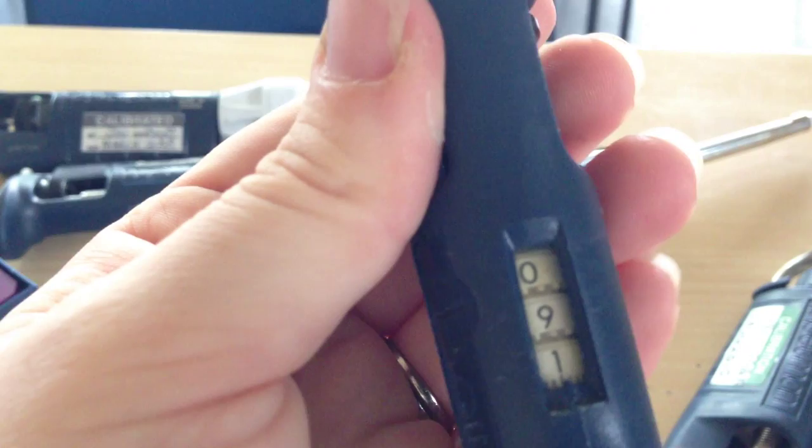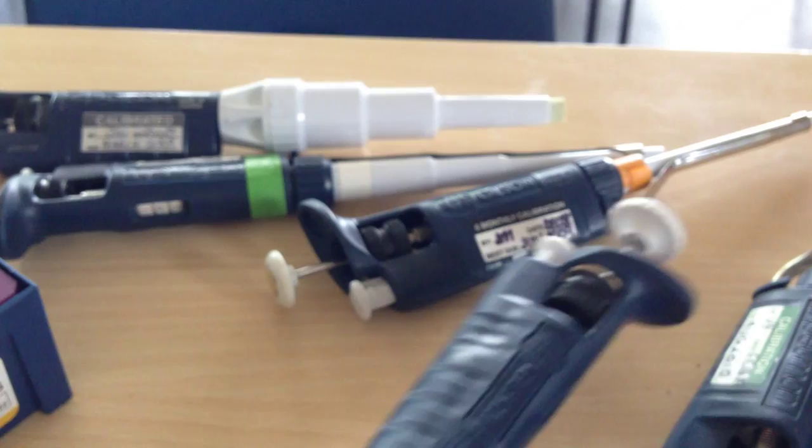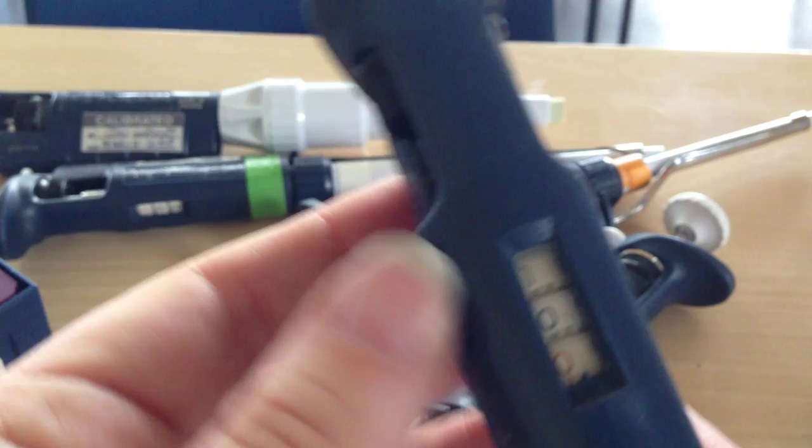So if we watch this as I change it around you can see the numbers go down. So if I set it to 91 that is 91 microliters. If I set it to 70 that is 70 microliters.